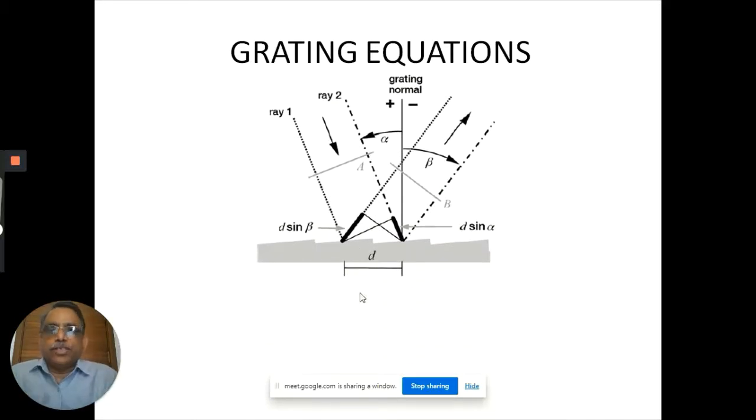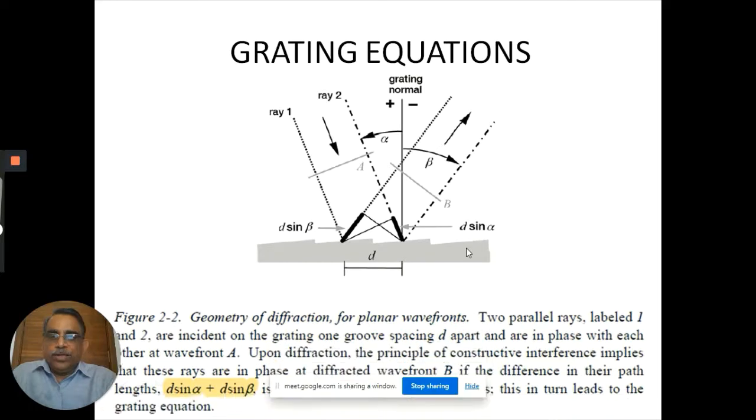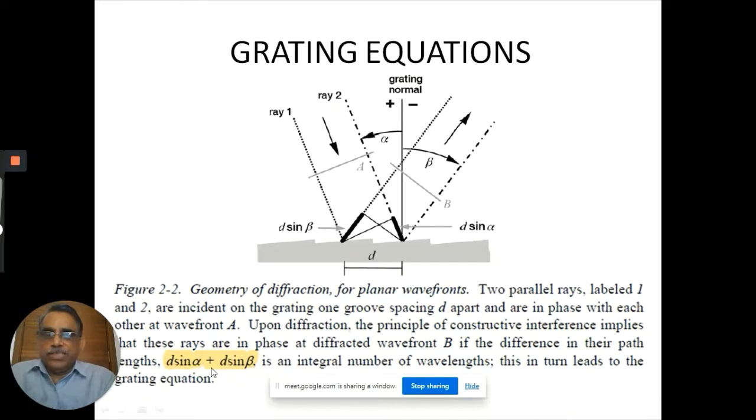which is called the grating equation. If I use two parallel rays, how exactly they get diffracted, what the path difference between them is, and what the d-spacing is, that's the way you look at it. If you interconnect all that, you get an expression d sin alpha and d sin beta. It's basically a minus sign, a path difference subtraction. Because the angle is negative, you put the +1 here. The sine of a negative angle becomes positive. So this is the basic equation, called the grating equation.